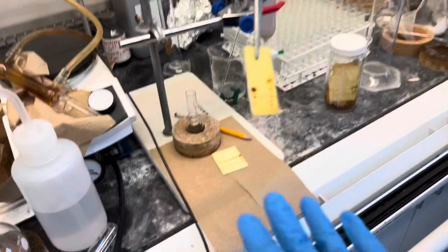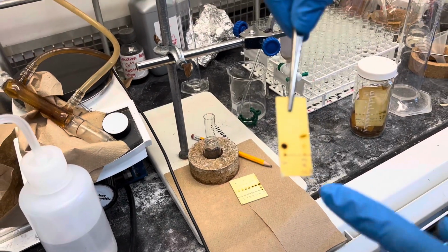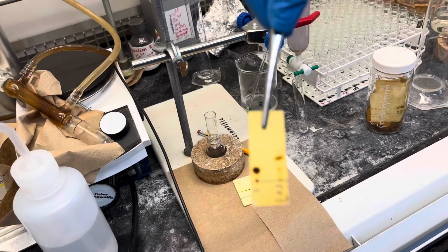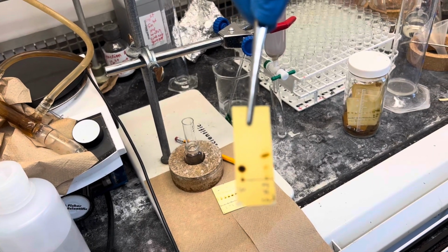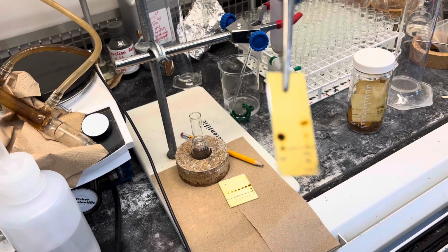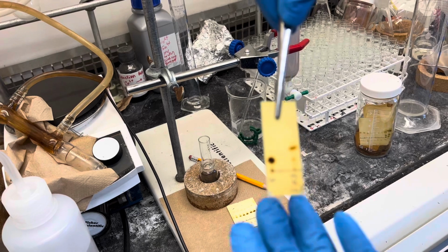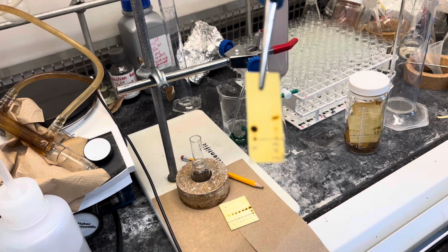So this is the TLC plate of my reaction, and this is the starting material to compare it with. This is right before I did the column to purify. Right side is the product, right? The top one. Yeah. Okay. Why does it look so pure actually here? It's odd. But anyways, so this was 20% ethyl acetate in hexane.